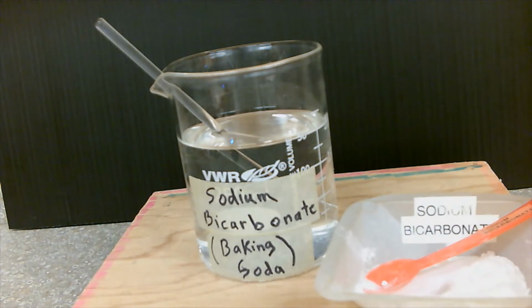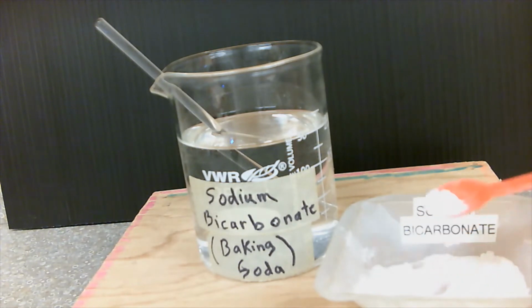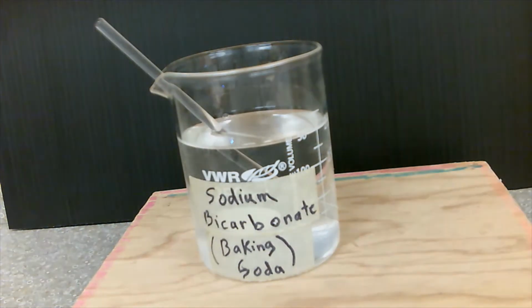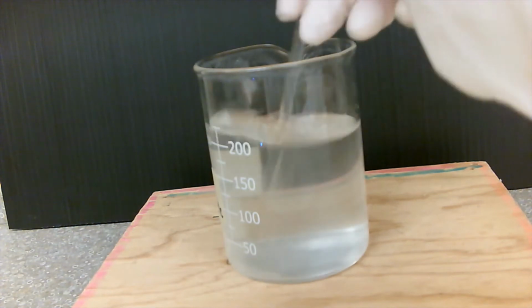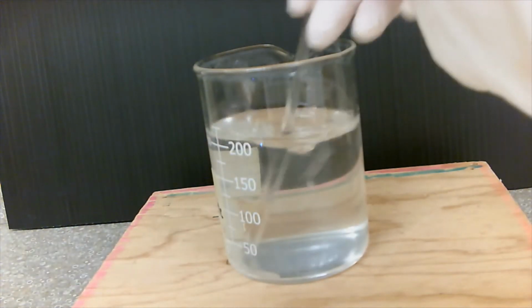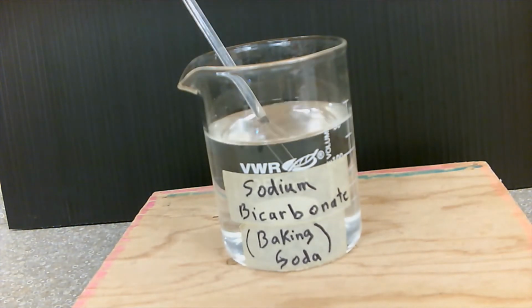Sample 9, which is sodium bicarbonate, or if you have this at home, it would be considered baking soda. Baking soda, sodium bicarbonate.